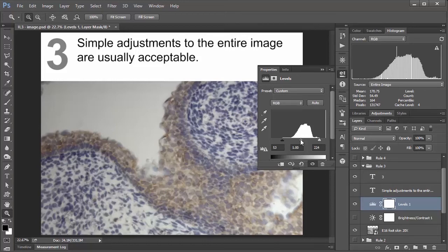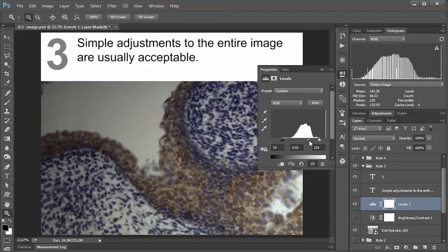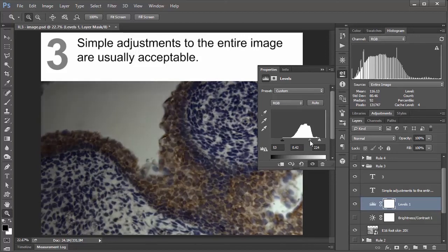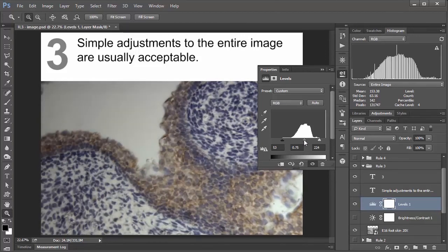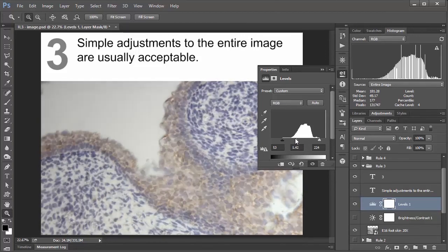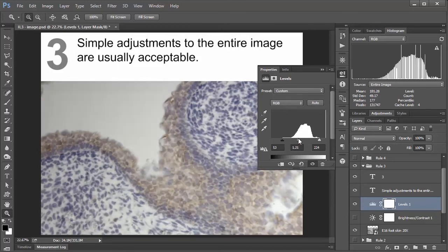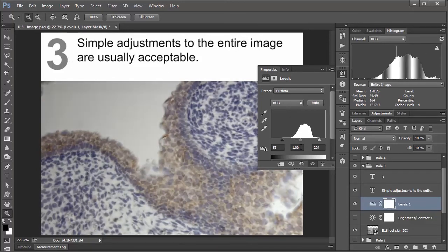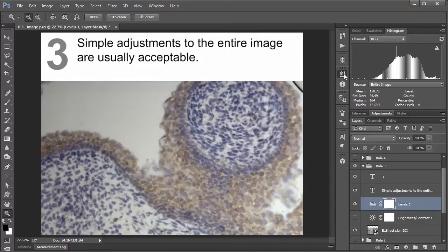One thing to note, this middle slider for your midtones, if you start messing with this, again, this does kind of another nonlinear transformation. So this is another thing you'd want to avoid, at least if you wanted to adhere to this guideline. So I'm just going to set this back to one. So I would say this is a perfectly acceptable way to increase the contrast in your image. So I will close that off, and we will move on to rule number four.